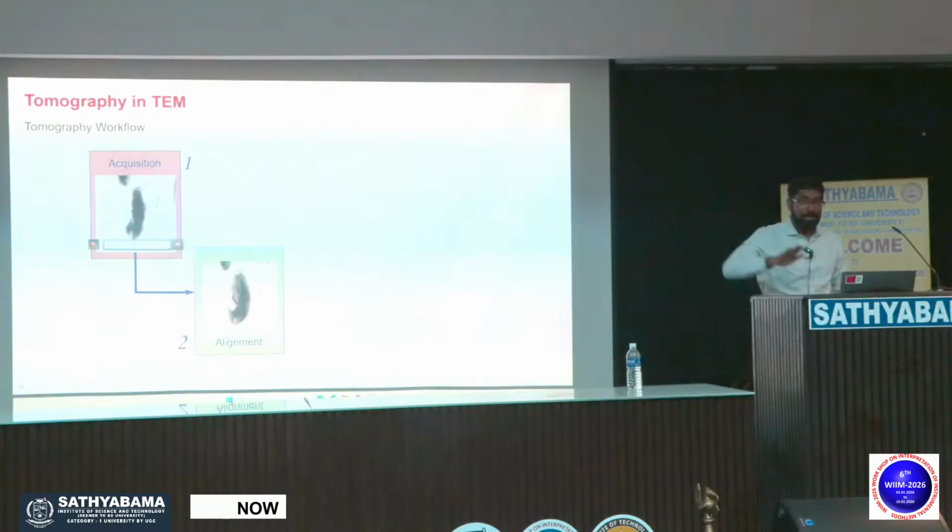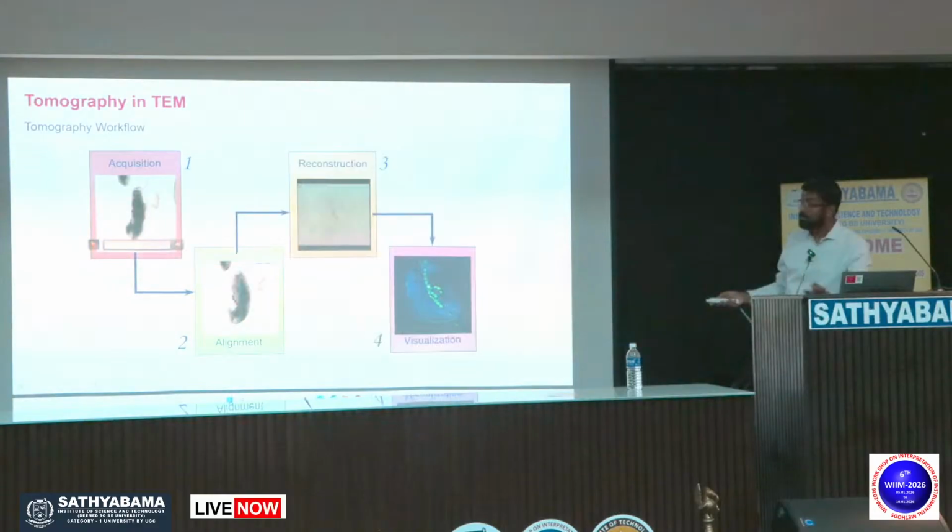Up to here, the microscope part is over. After this, there are two processes. I will not go into the reconstruction process. You can see ultimately there are particles. This is a bacteria sample. See, particles are distributed all around, up top and in between. So only with 3 dimensions is it possible to answer such questions that we cannot answer in 2-dimensional projections. So the 3-dimensional process is called tomography.